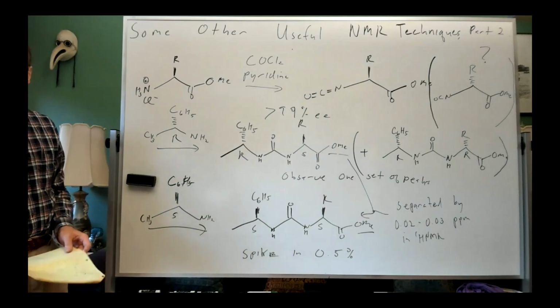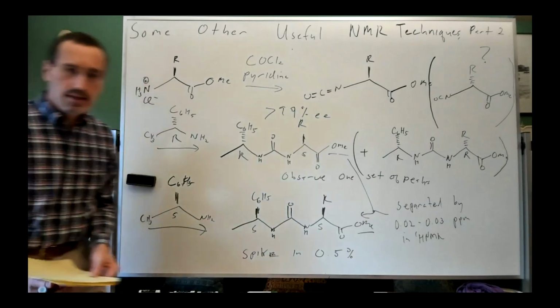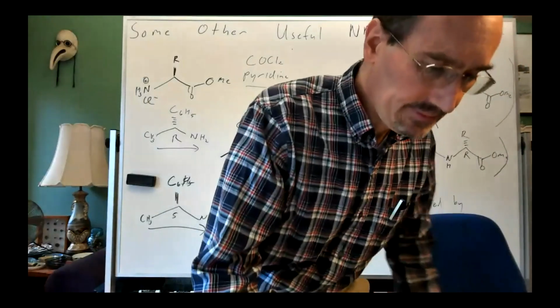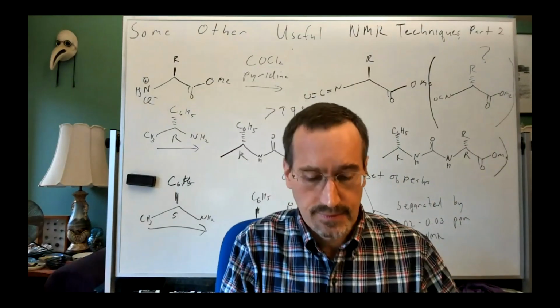And you could do the same thing in your own research in a synthetic methods project. James? Yeah. Could you please explain the spiking and how you knew that it was over 99% again, please?